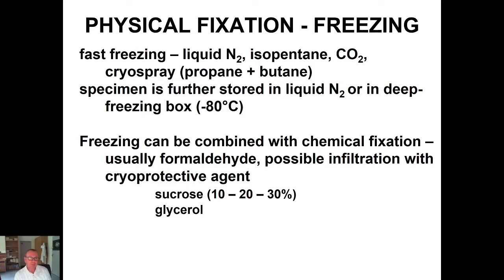So, for example, if we haven't got liquid nitrogen or some other solution necessary for fast and deep freezing, we can overcome this problem by using cryoprotective agents.